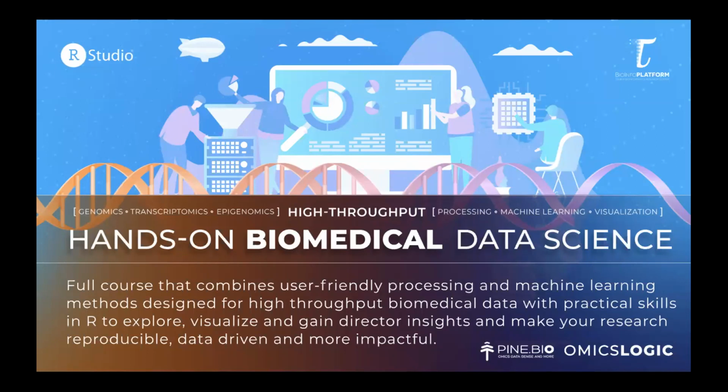We're going to start, and today's session is a part of our program called Hands-on Biomedical Data Science. It's a part of our series called OmicsLogic. In this series, we talk about different types of data, and we talk about different types of analyses, as well as challenges. So this particular data science program is focused on preparing the data for analysis using visualization, using processing tools, and then using practical approaches to get insights from that data. And we'll talk a lot about machine learning and data normalization, preparation, visualization, and other things.